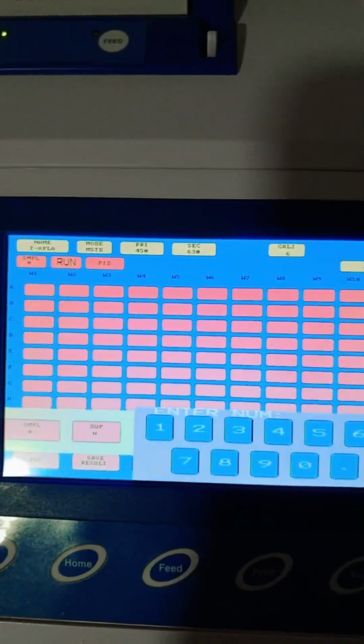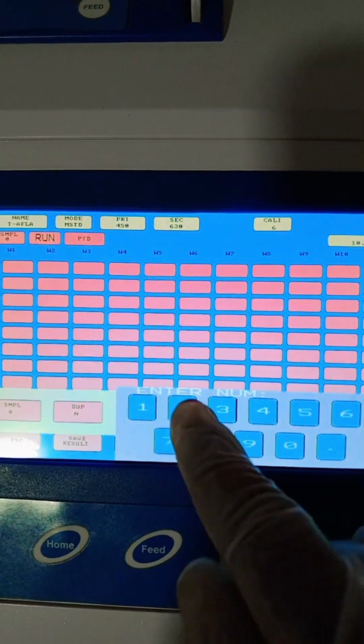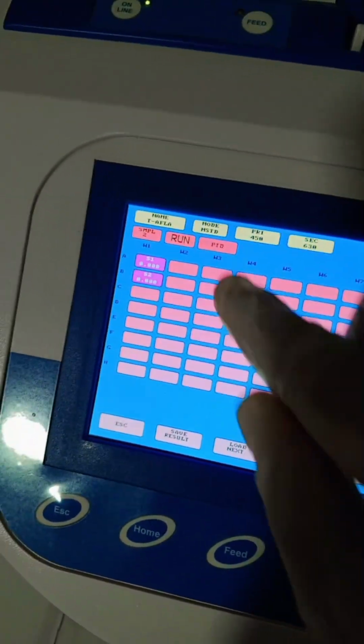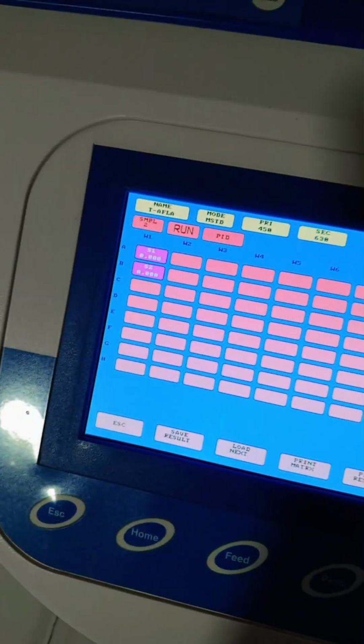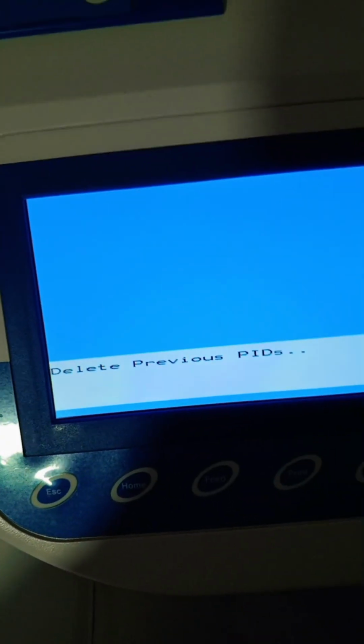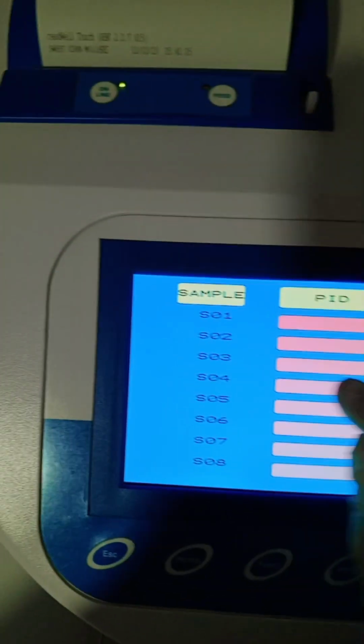So in this case I had 2 samples. I had to press 2 because I had 2 samples. You see me entering the number of the samples, 2, enter. And then next you label. Now you say the code given to each sample. Sample A, it's for unique code given, maybe customer A, the name, customer B, the name.